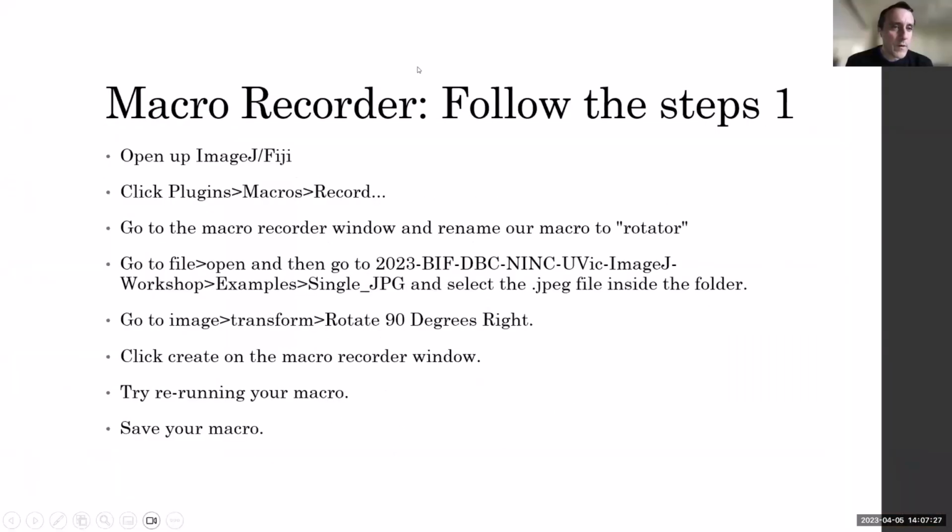So while people are working on it, Amy, there's a question in the chat about running macros from within macros. So maybe we can try this on your macro example with the rotator. Okay, sure.